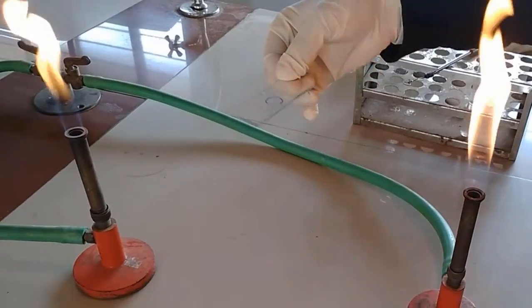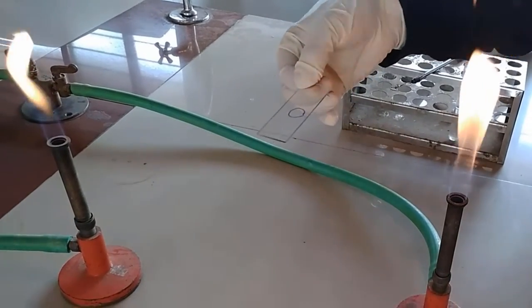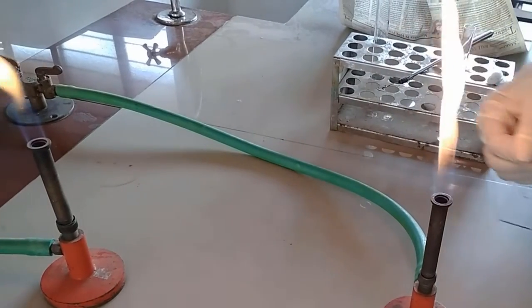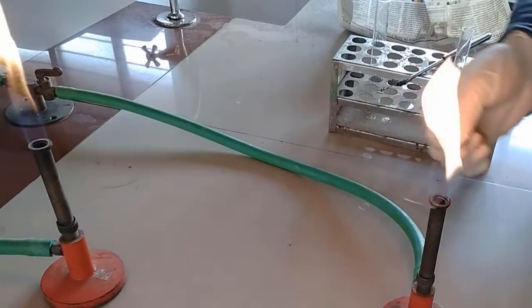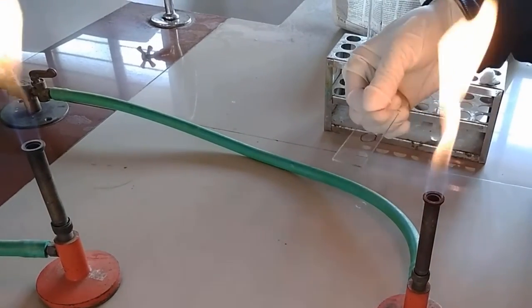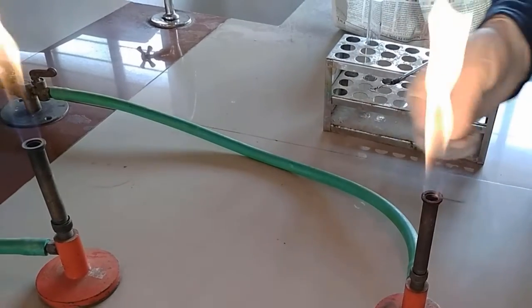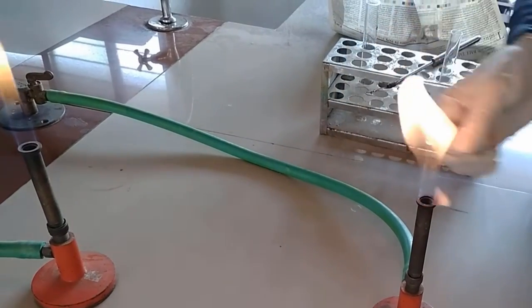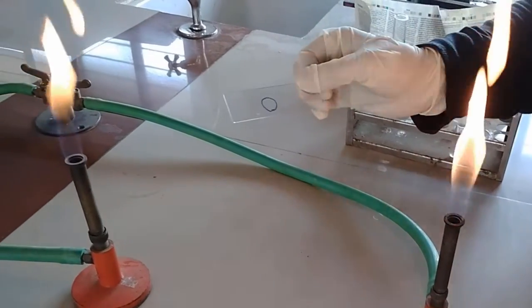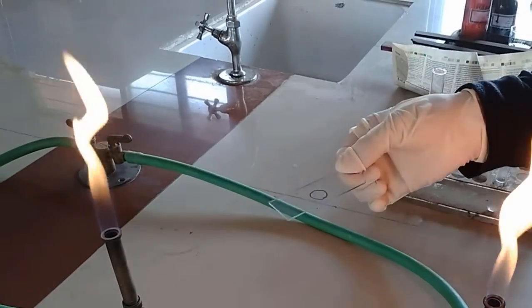will not be seen. Now we will heat fix this inoculum by passing this slide through the flame 4 to 5 times. Heat fixing helps the microbes to stick to the slide and prevents their washing off or movement. Now you can see that the smear has been completely dried.